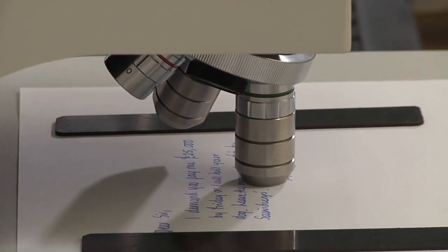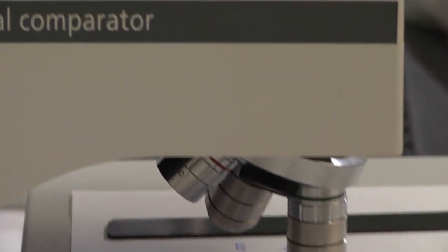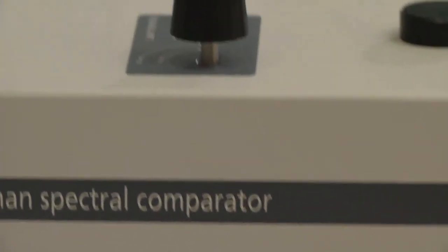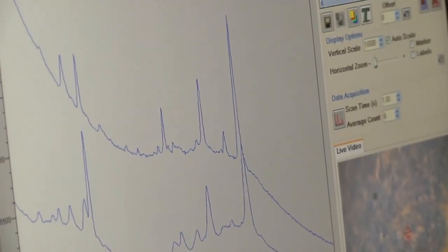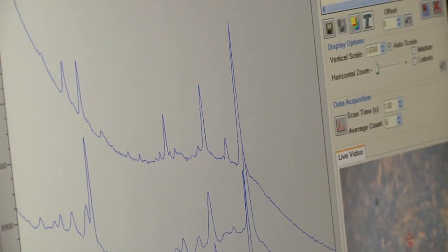The results have allowed me to place different brands of gel pen into groups based on a comparison of their spectra by eye. This information provides the forensic scientist with an idea of how common a particular ink is, as well as how useful the technique of Raman spectroscopy is for telling different brands of gel ink apart.